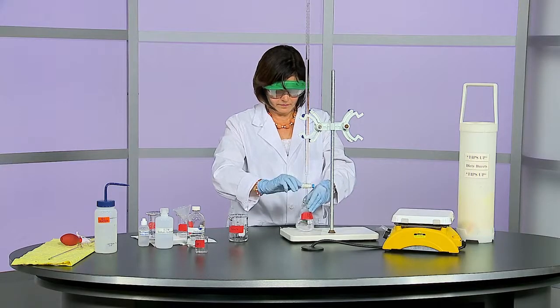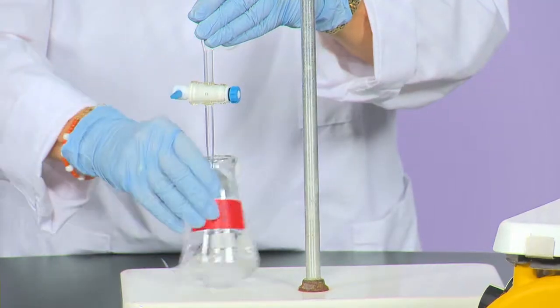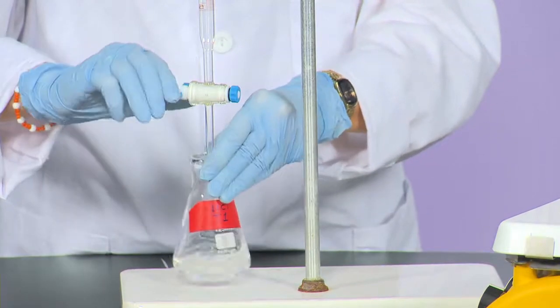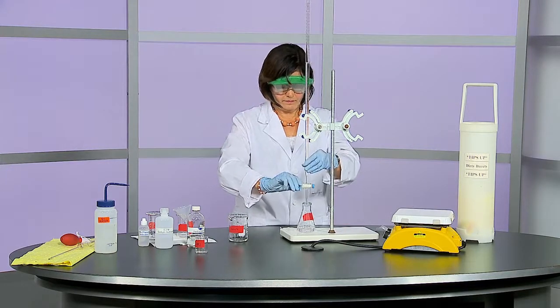When the pink color starts to take longer to disappear, add the titrant dropwise. A small drop can reach the desired pink color, whereas a big drop can overshoot the endpoint. If that happens, you will have to discard and repeat the trial. Practice delivering small drops. You can use several methods.